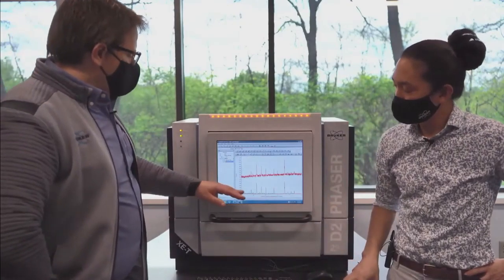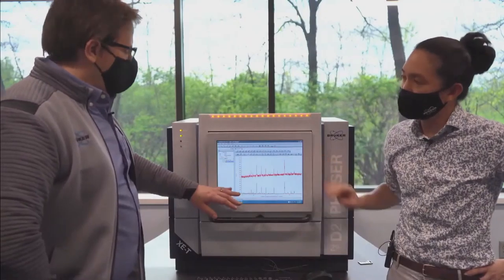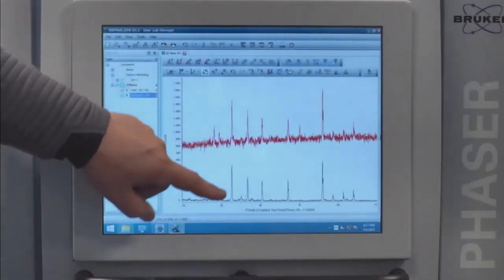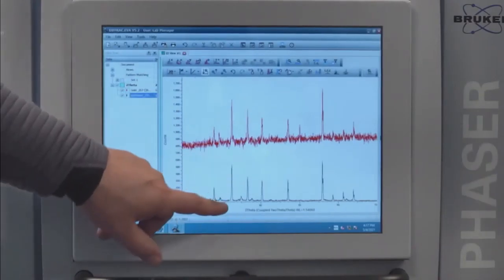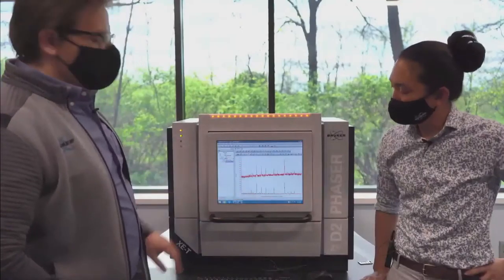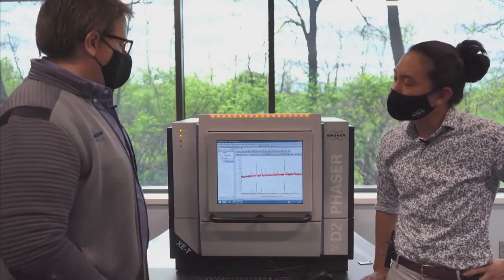And this isn't just waterfalling or moving this scan up. This is the raw data, right? Yeah. That is really amazing to me when we look at the signal to the background, significantly better here. Exactly. And even in these one minute scans, we can draw so many more conclusions about this sample. You have a lot more confidence when it comes to the peaks.